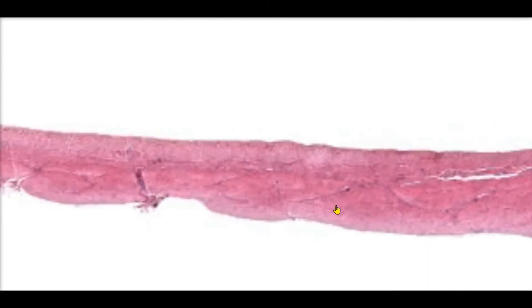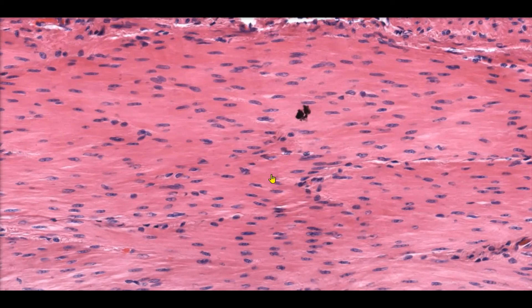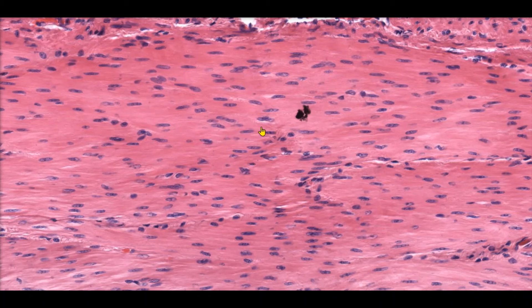Let's zoom in on a longitudinal section of smooth muscle so we can get a better idea of how these cells look. Notice how the cells of smooth muscle are very short and fusiform. Fusiform is just a fancy way of saying that they're thick in the middle and then taper off as we get to the ends. Each smooth muscle cell contains a single nucleus. Smooth muscle tissue gets its name from the fact that there aren't any striations — we don't see a striped pattern like we did with skeletal muscle or cardiac muscle. This makes the cells appear smooth.